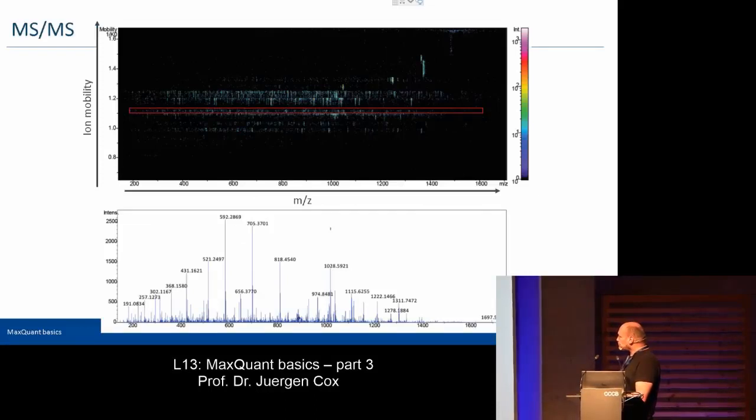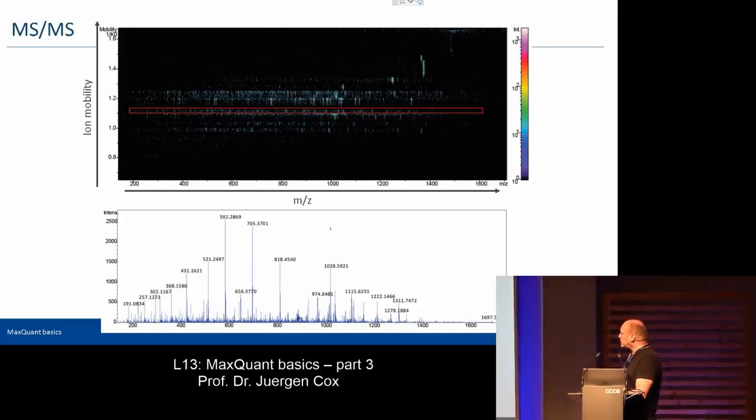So now we have the basic data, we have the MS1 features, and for these we also use the mass calibration ideas that we had before. As I mentioned before, now it's also depending on the collision cross-section and on the intensity of the peak. So it's a non-linear recalibration based on 4 continuous parameters. So we have high mass accuracy, or as high as possible, by correcting for the systematic effects.